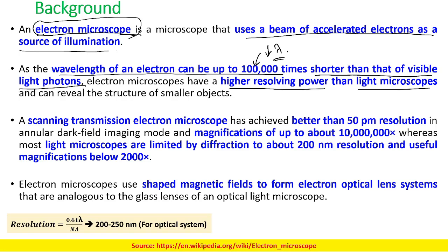The sensor does not detect the color. The color is synthesized in the software after the signal has been captured by the camera. Okay.